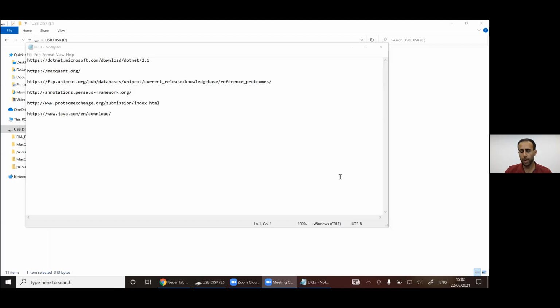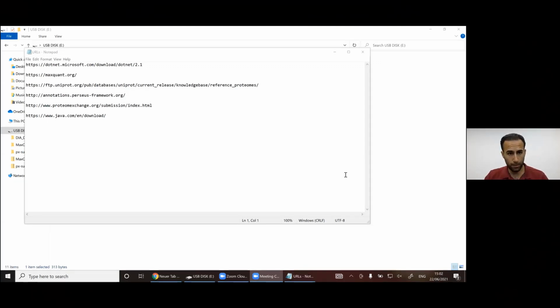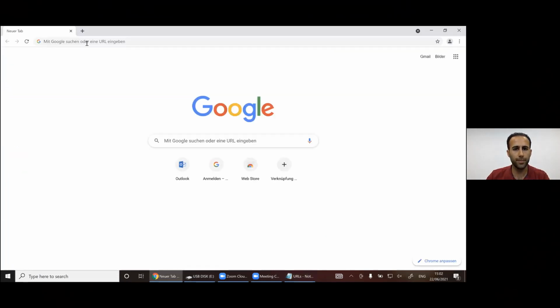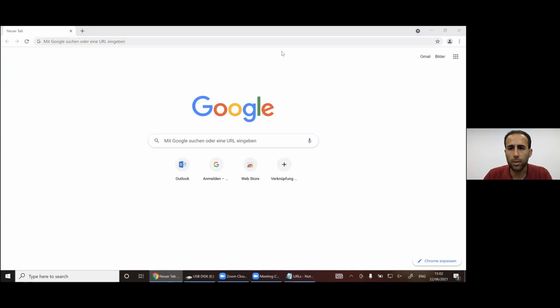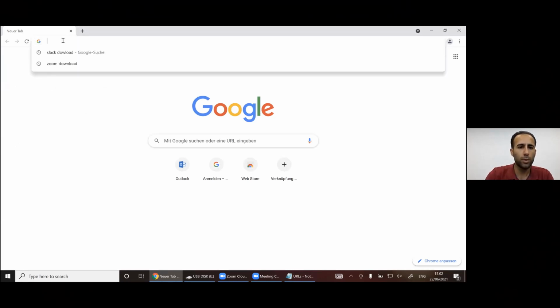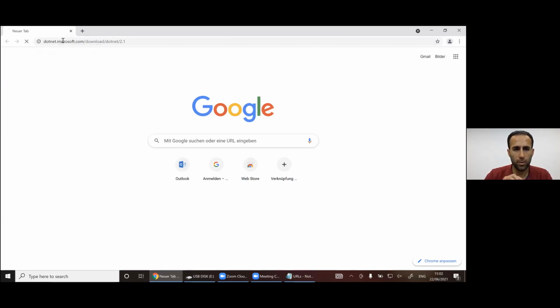There we go. So what you need to do if you don't have .NET Core 2.1 is browse to this website from Microsoft.